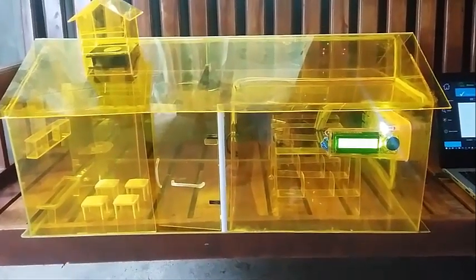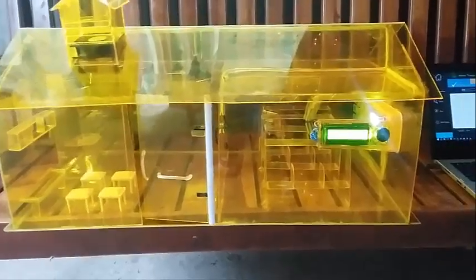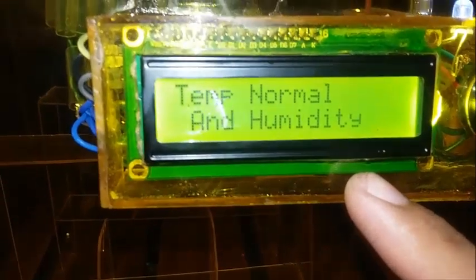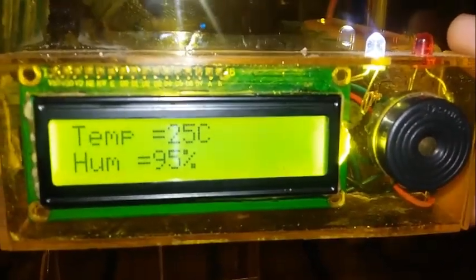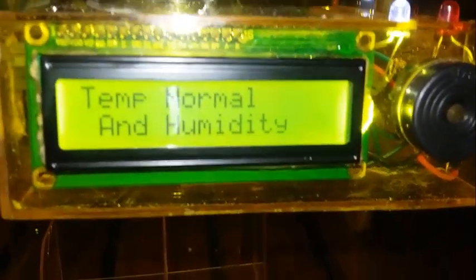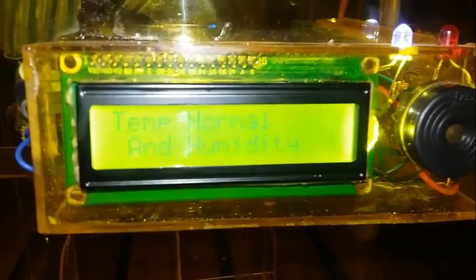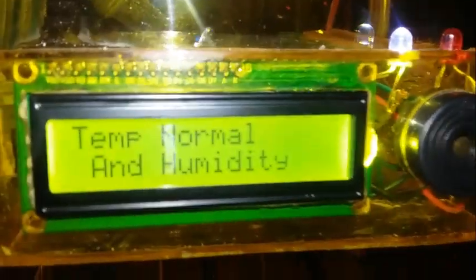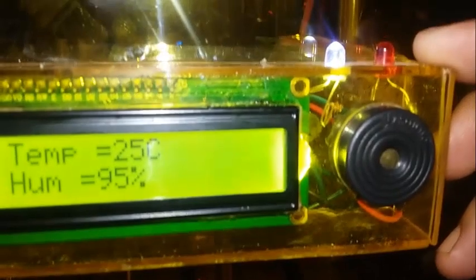This is the LCD for displaying the temperature and humidity. This is the LED light for determining the temperature inside the laboratory. If the laboratory has a temperature of 24 to 28 degrees Celsius, that is normal, so the white LED will turn on.